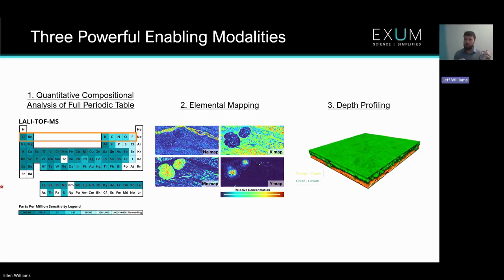All of these sorts of questions that researchers or industry professionals could never ask before, we can now answer. And we did it in a vacuum environment, so we didn't have to worry about the lithium catching on fire, which is always a plus.